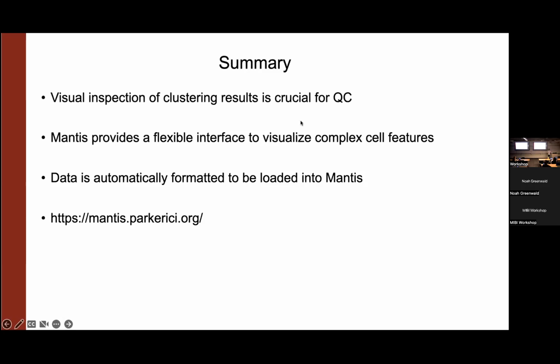Probably there will be things you need to correct. So then you do go back in Pixie and correct them, not in Mantis. But the goal is not to keep redoing it until everything's perfect. The goal is to redo it until you're happy with the results and confident that downstream analyses won't be affected.